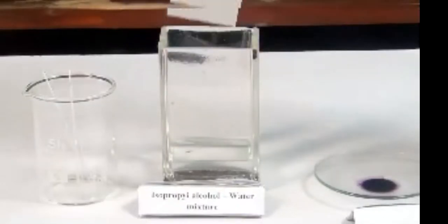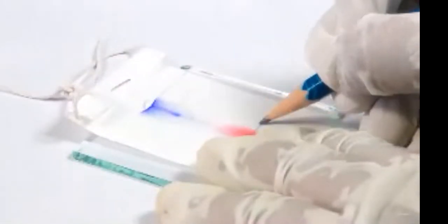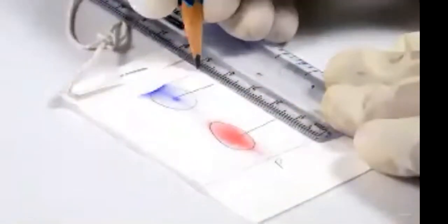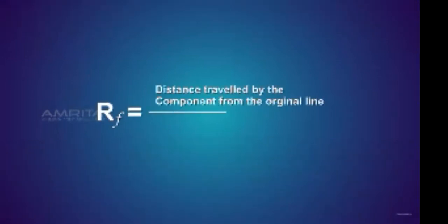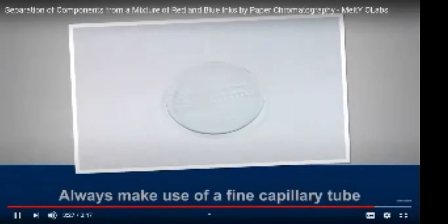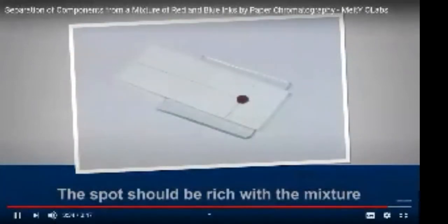After the solvent has risen, you will notice two different spots of blue and red colors on the filter paper. Take the filter paper out and mark the distance the solvent has risen — this is called the solvent front. Dry the filter paper and mark the center of the red and blue ink spots. Measure the distance of each spot from the original line and the distance of the solvent front from the original line. Calculate the Rf values using the formula: Rf = distance traveled by the component from the original line ÷ distance traveled by the solvent from the original line. Precautions: always use a fine capillary tube, keep the chamber undisturbed and covered, and ensure the spot is rich with the mixture.